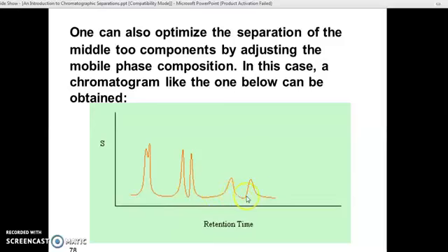But in this way this is also fine and this is also fine, but this is not completely accepted. In case of the composition of a mobile phase, you need to think about that and change certain fundamental factors and parameters whenever you are going to run the chromatographic technique. Now the optimization of the separation with these two adjacent is fine.